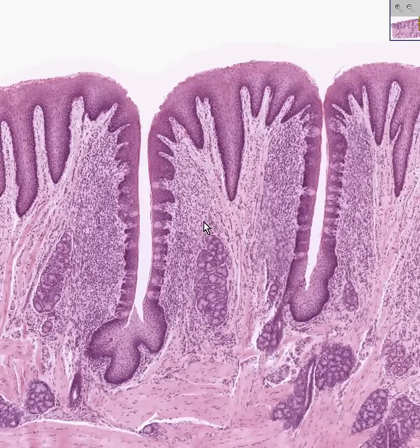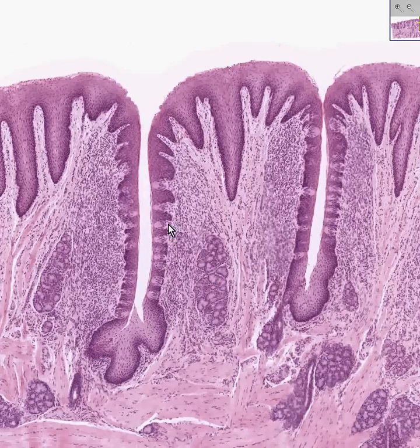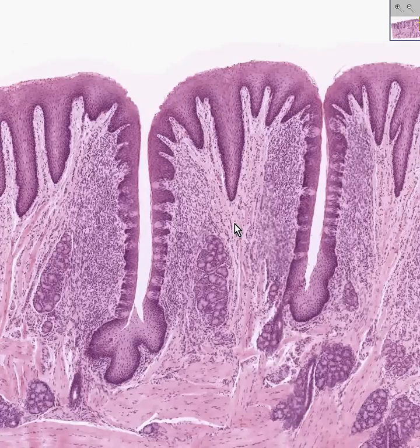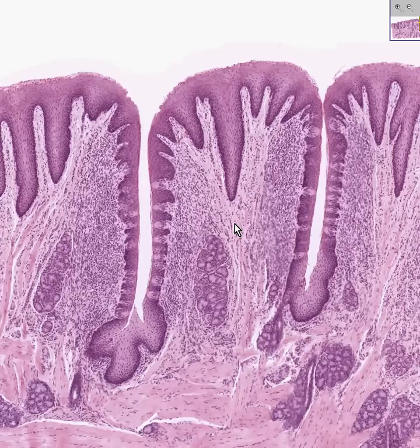Last but not least, you have that last type of papilla which does not have taste buds, and that's the filiform. Those are just little spiky areas of hyperkeratinized epithelium involved with combing the food. Just as a cat would lick you and it feels like sandpaper — those are the filiform papillae, the only kind that does not have taste buds.